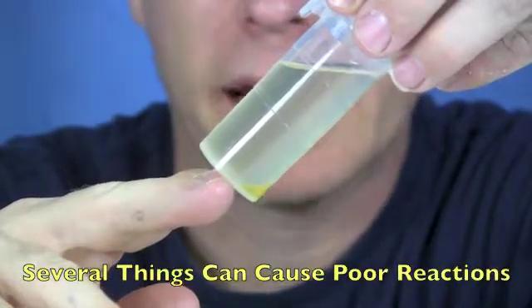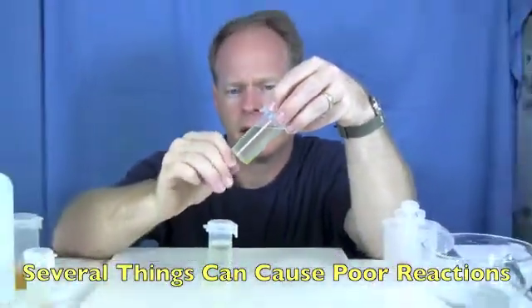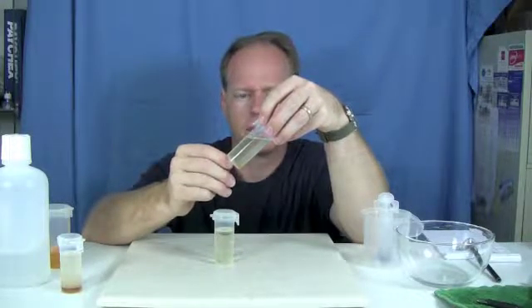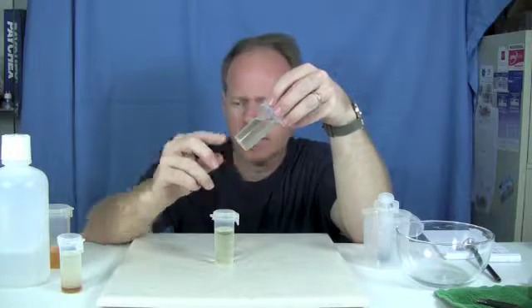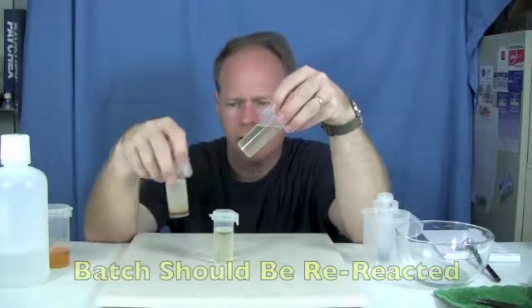What causes bad reactions are water in the oil, catalyst that's going bad, not adding enough catalyst, not adding enough methanol, or it just didn't mix real well. I can already tell that this is settling out quite a bit — I don't have the full three milliliters settling out, but I do have a fair amount settling out.